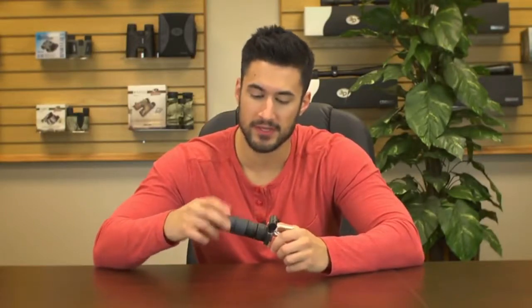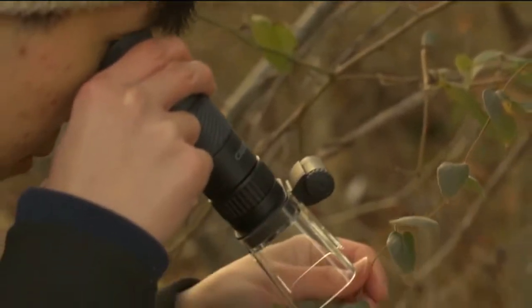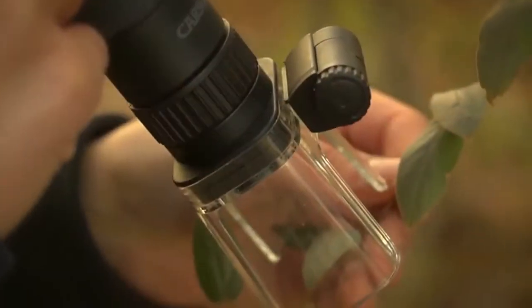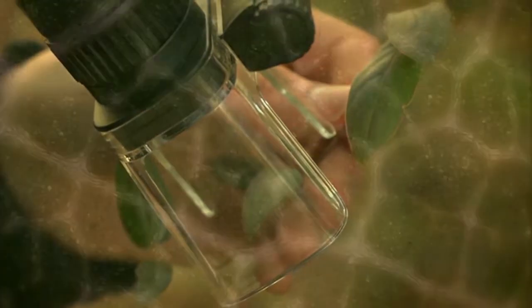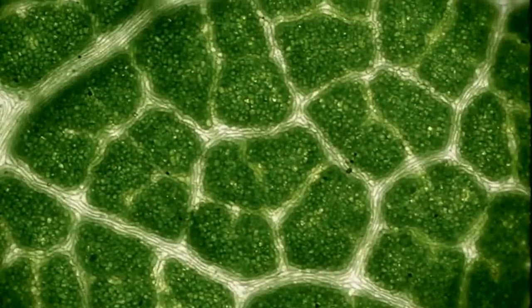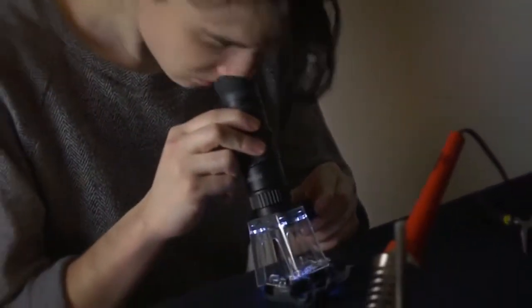When you attach both items together you end up with the self-standing LED lighted portable microscope. Want the ability to see 25 times your eyesight at any given time? Now you can, because even when completely assembled the Magniscope weighs in only a quarter of a pound. In handheld mode the microscope works exceptionally well for inspecting things like plant life, or you can stand it up and use it like a traditional reflective microscope.